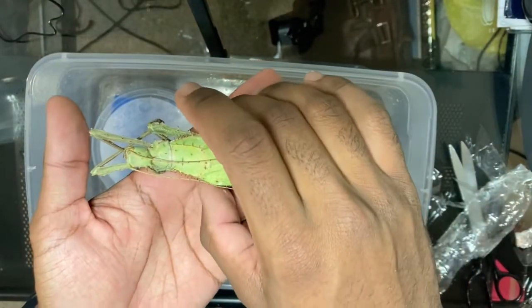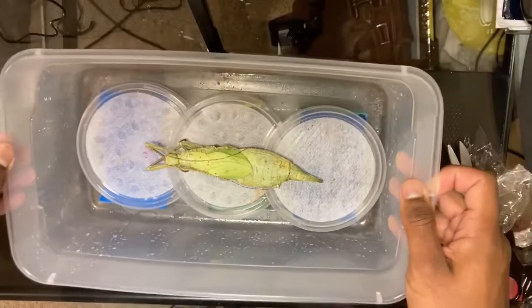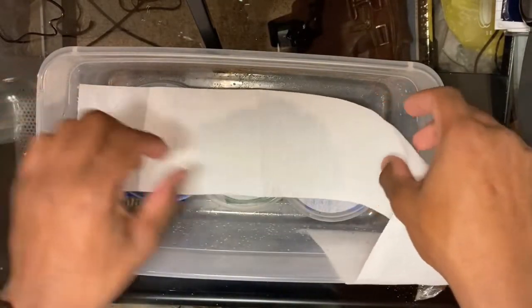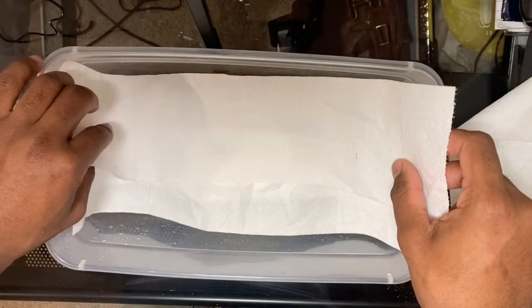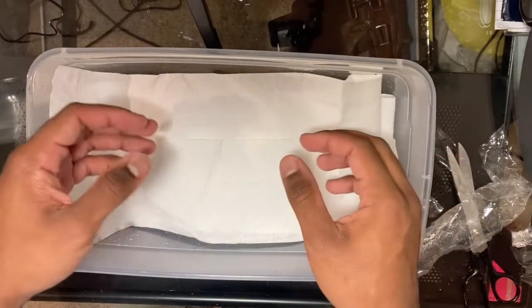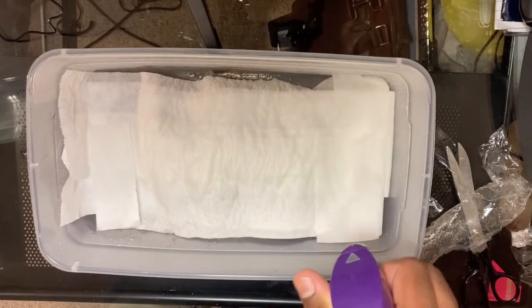Once you've got your insect, you're going to gently place it on top of the lids or whatever you're using as a cover over the sponges. Just lay it right in the middle. Next, you're going to get some toilet paper and lay it right on top of your insect. Apply a couple of layers — you could also use paper towels, it does not have to be toilet paper. Then take a spray bottle and start spraying the toilet paper or paper towels.